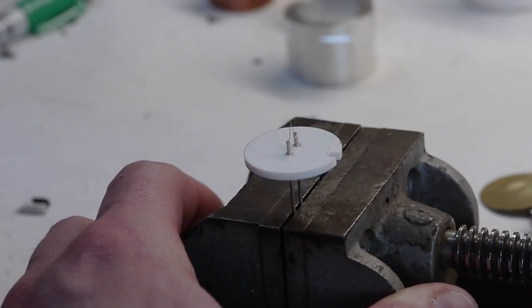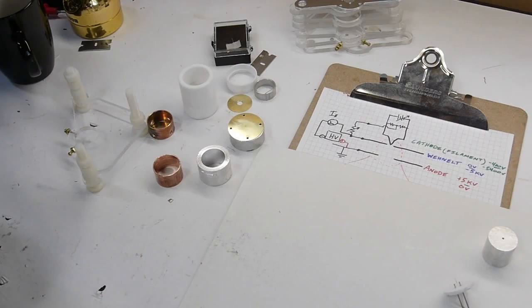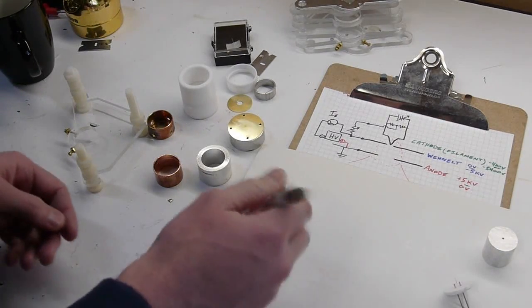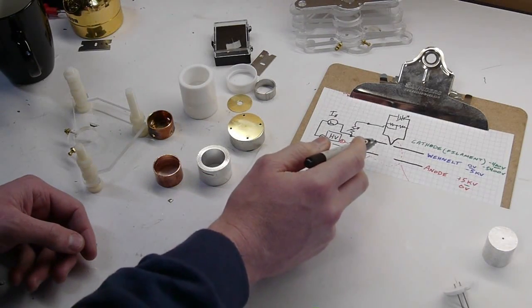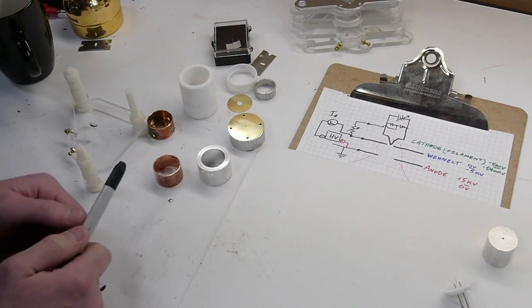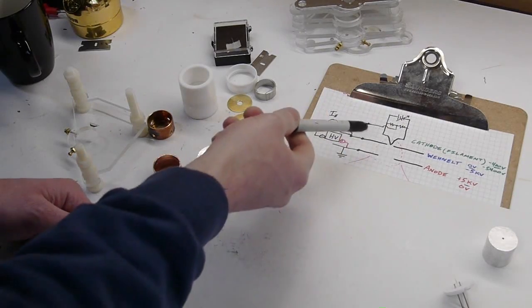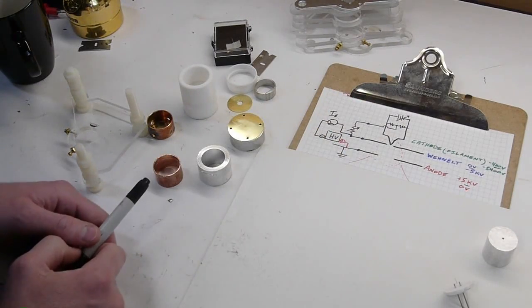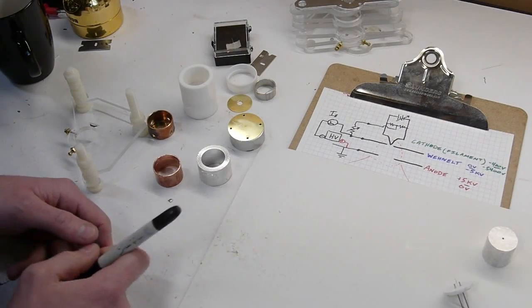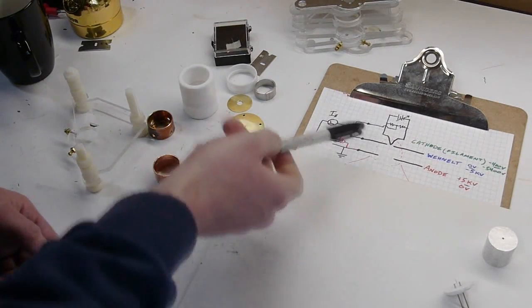And let's talk about the operation now. So when you read a description of how this works on the web, almost all of them say something like 'well the electrons are liberated from the filament and they're attracted to the anode.' And that's true, but only in a very limited sense, and it kind of bothers me.